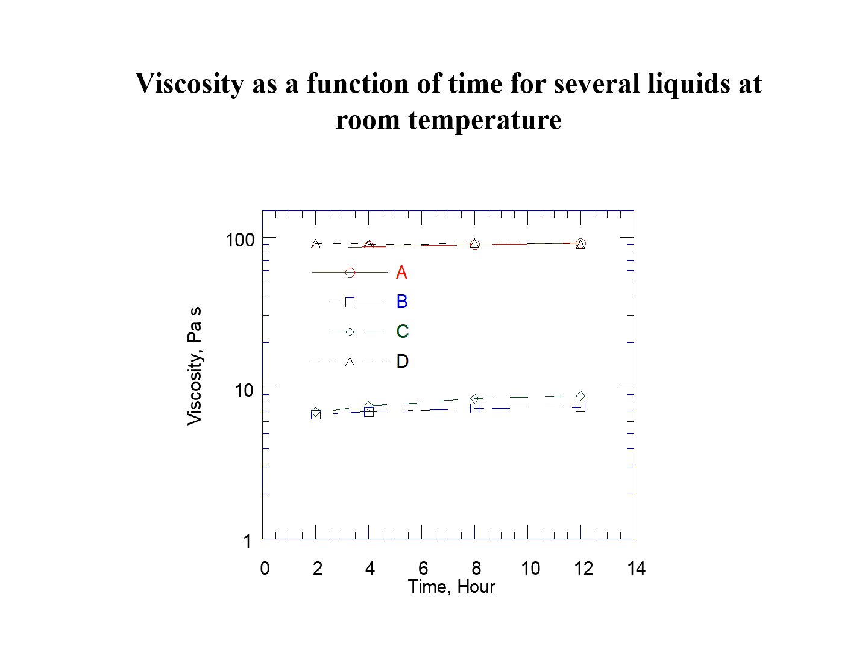Viscosity as a function of time for several liquids at room temperature. So this figure shows the time-dependent viscosity for several materials. As shown in this figure, all these materials' viscosity is very consistent, and doesn't change much with time.